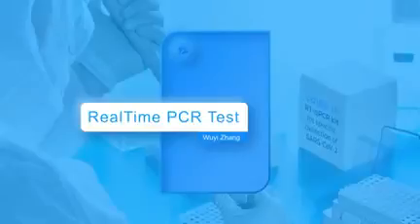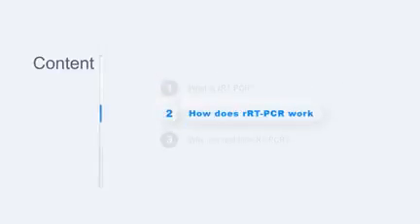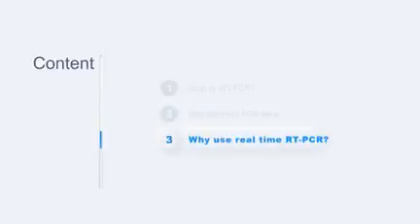My name is Wu Zhang, and my report topic is real-time PCR test. I will introduce what is real-time RT-PCR, how does real-time RT-PCR work, and why use real-time RT-PCR.